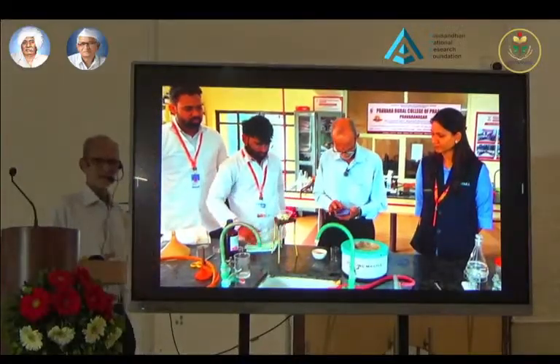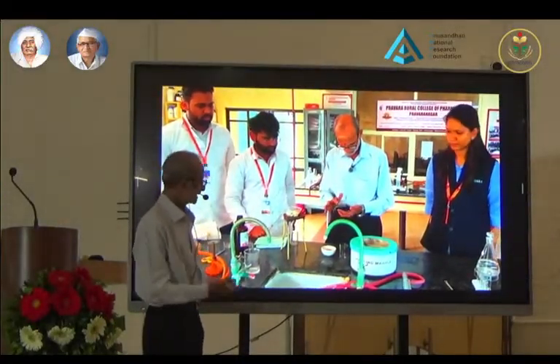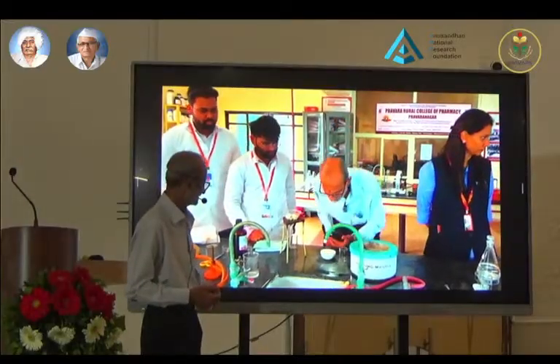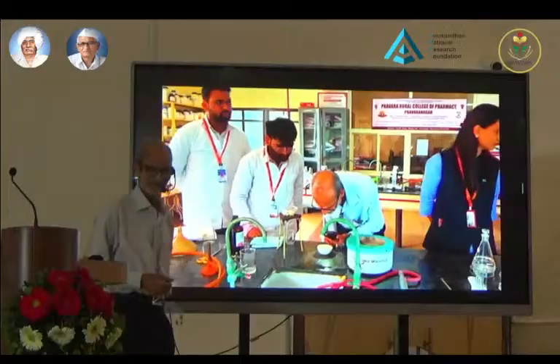I'm just trying to confirm whether the product is getting separated or not with the help of the torch. And yes, I could see the product.